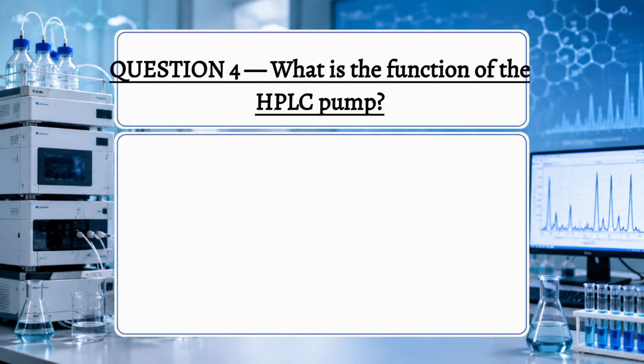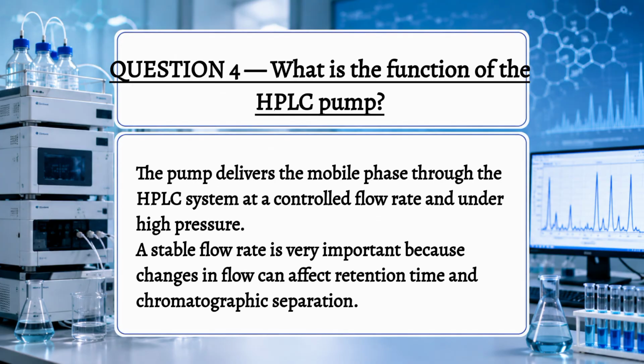Question 4. What is the function of the HPLC pump? The pump delivers the mobile phase through the HPLC system at a controlled flow rate and under high pressure. A stable flow rate is very important because changes in flow can affect retention time and chromatographic separation.